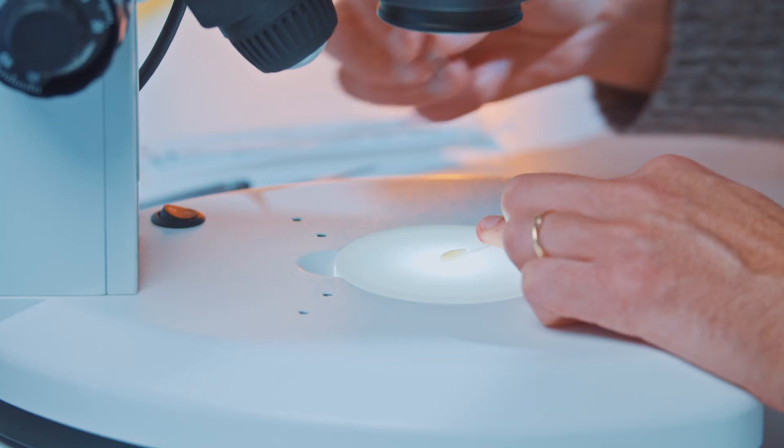Let me take my tool here so we can show you how soft this is. Maybe I can hover over here. Yeah, you can see now my tip here, it's moving over the surface and it's, yeah, it doesn't have a lot of resistance. Just moving over and super soft, looks okay. And also nothing detaching, so that's also good news.